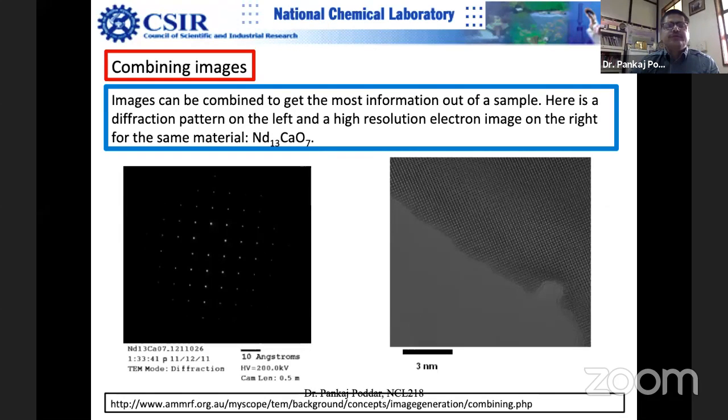So one by one you can unmask one point, and then you do the reverse Fourier transform. So suppose you want to calculate the interplanar distance here, and it is very confusing in HRTEM many times. So in that case, to remove the noise, if you're not able to see the planes clearly, this really helps.